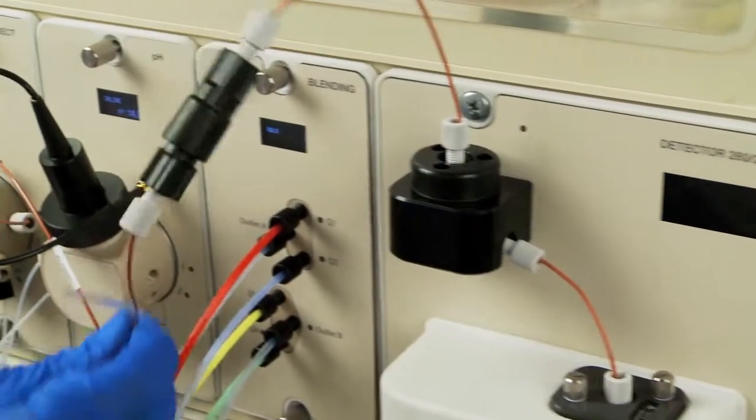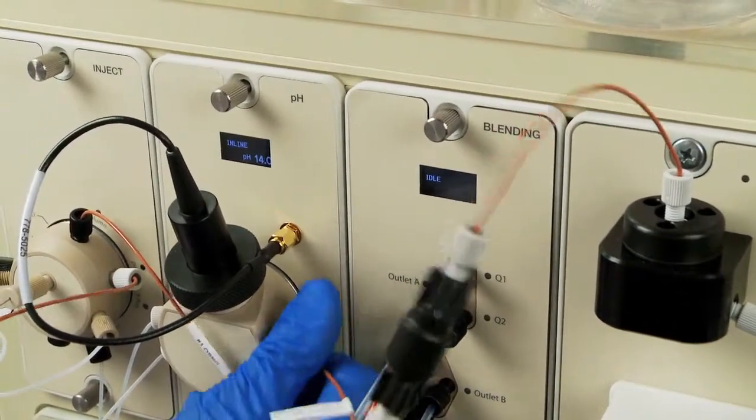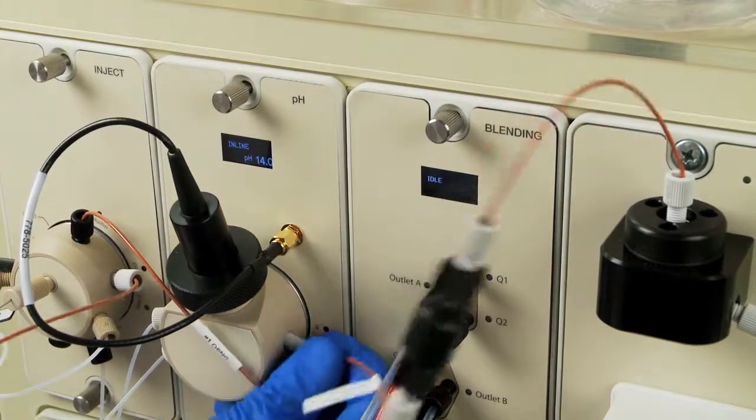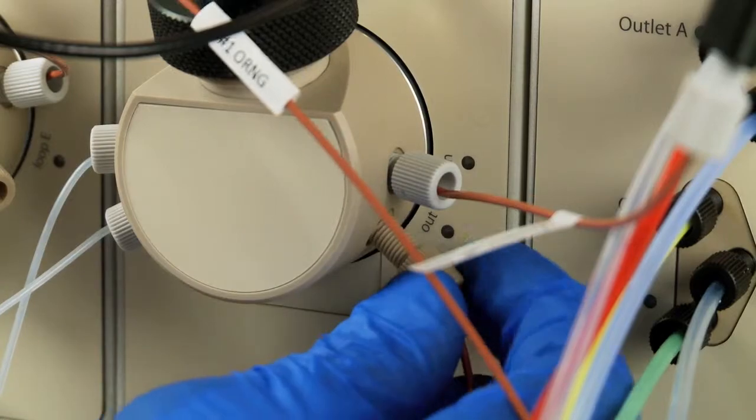Connect line number 2 from the 40 PSI back pressure regulator to the inlet port labeled IN on the pH valve. Connect line number 4 to the outlet port labeled OUT on the pH valve.